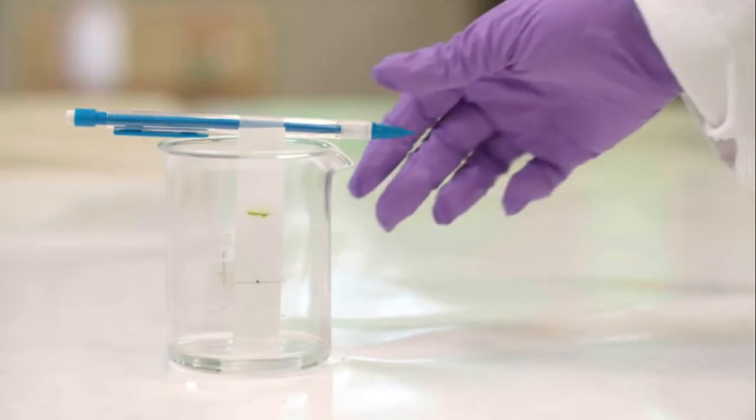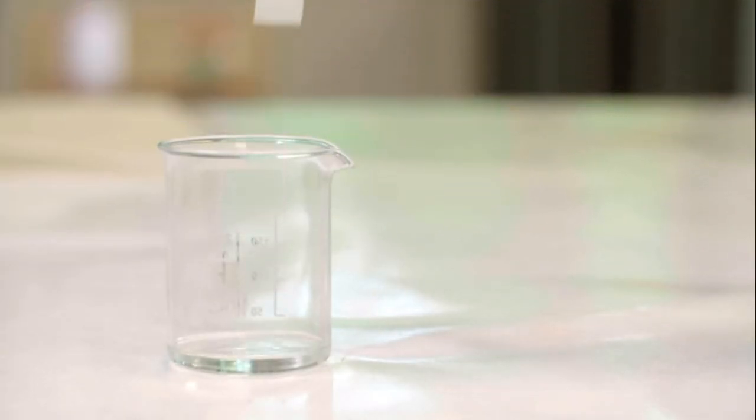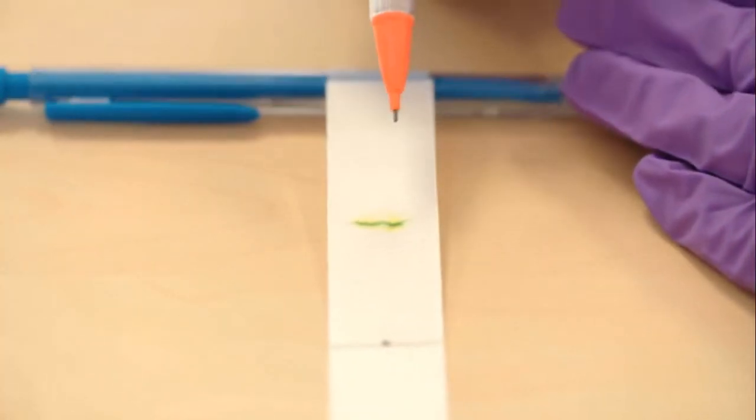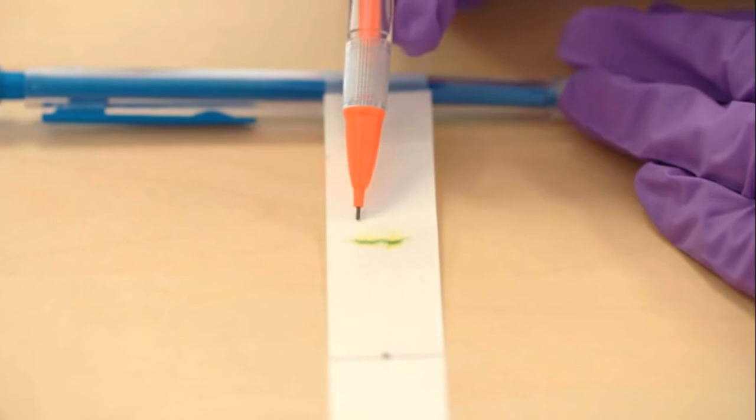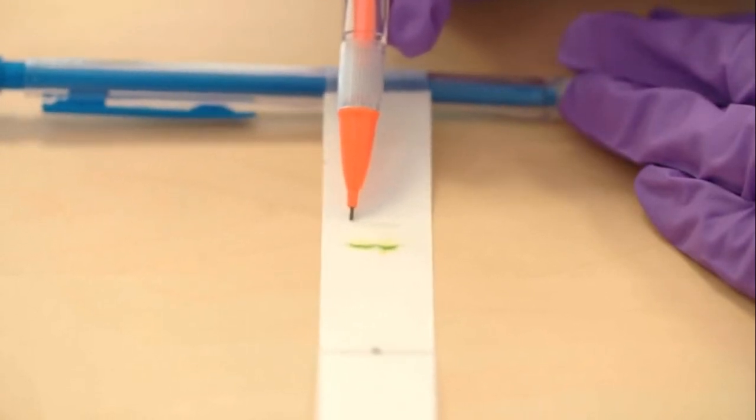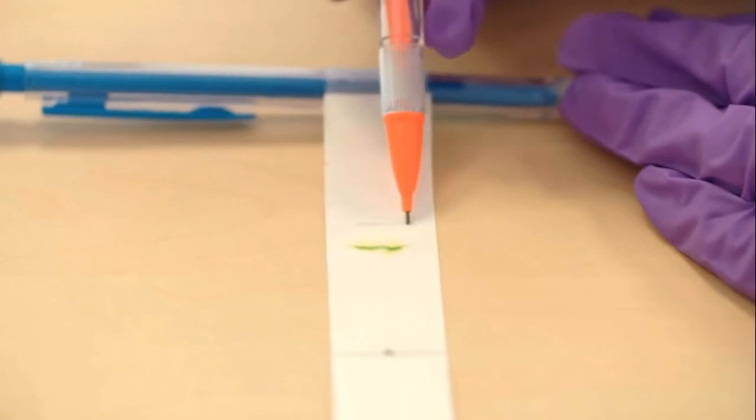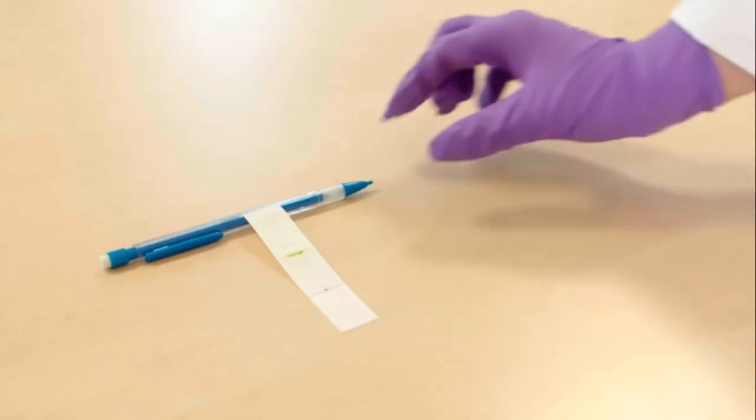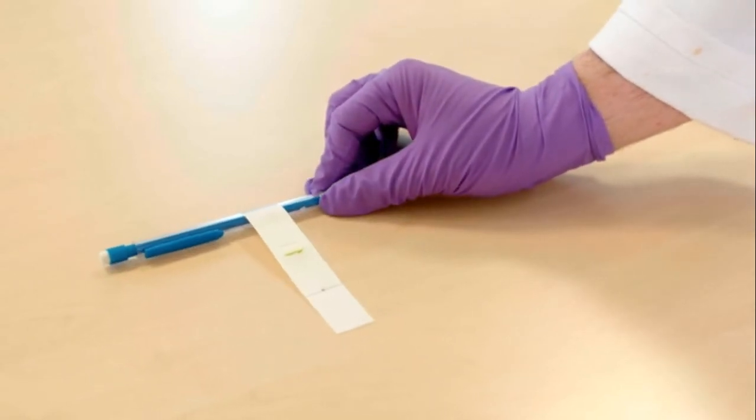When the propanone line approaches the top of the paper strip, it is removed. A pencil is used to mark how far the propanone has moved up the paper. This is called the solvent front. The paper is dried with the hairdryer.